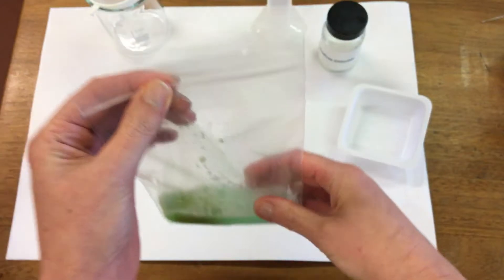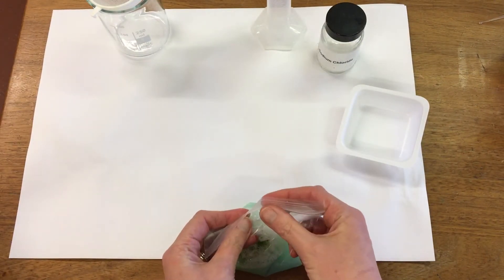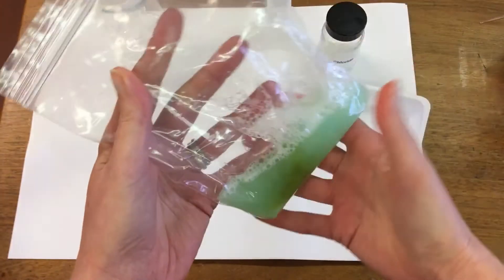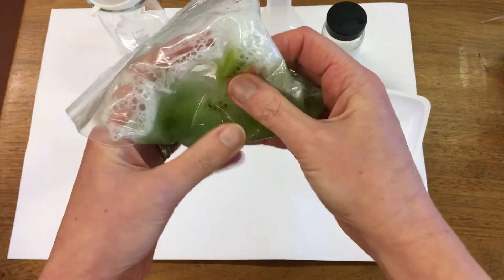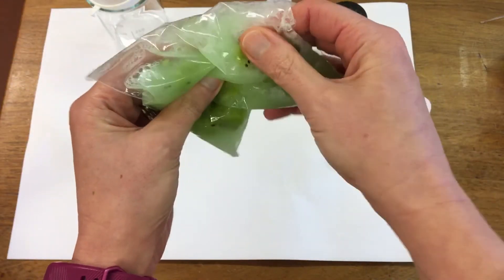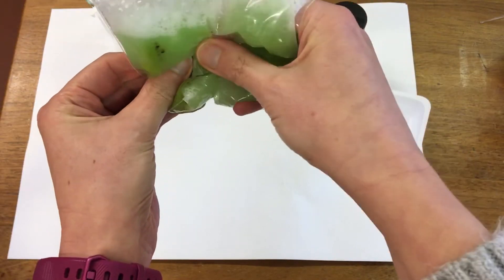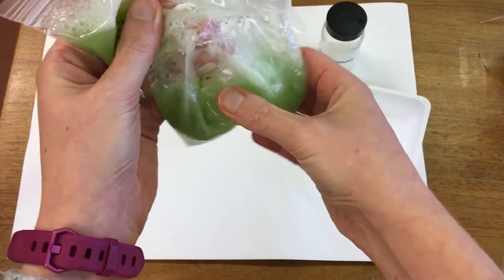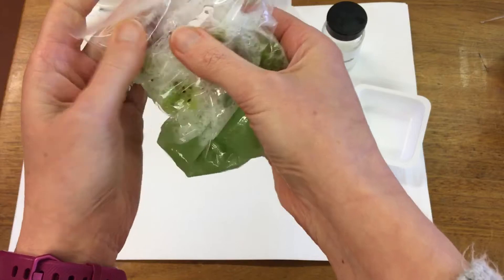I'm going to seal the bag, get rid of the air, seal the bag and then squish up our kiwifruit. The extraction solution breaks open the cells and it helps the DNA to come out of the nucleus and the cell membranes. So we're just breaking down all our cells.